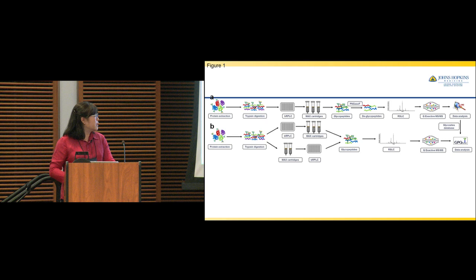In this approach, we tried to investigate whether the peptide should be fractionated first or enriched first. This is the original investigation where we tried to establish the phosphoproteomics approach. There, we concluded that fractionation followed by IMAC enrichment for phosphopeptides gave us a high yield of phosphoproteomics coverage. In this case, we tested two strategies.